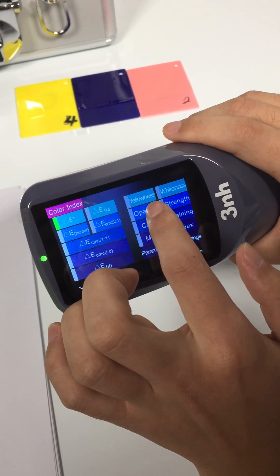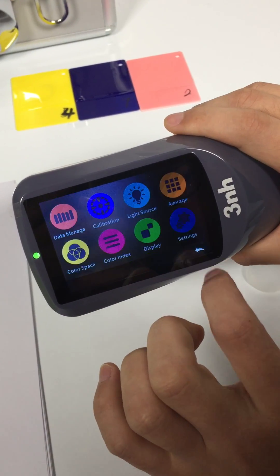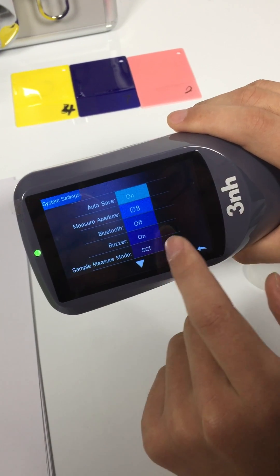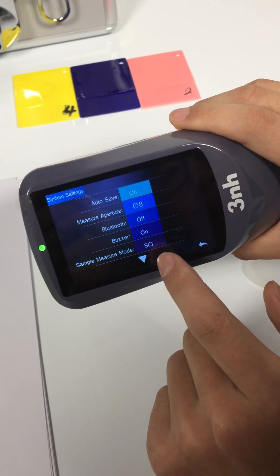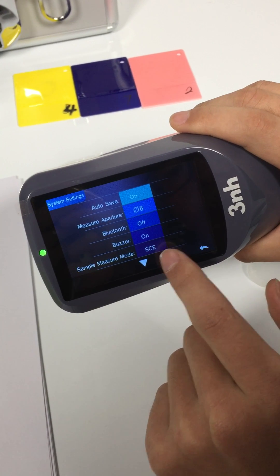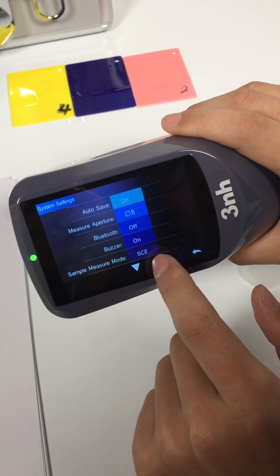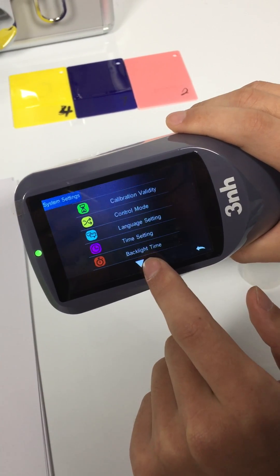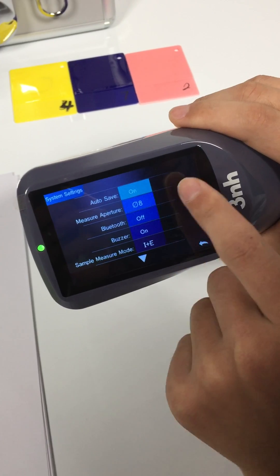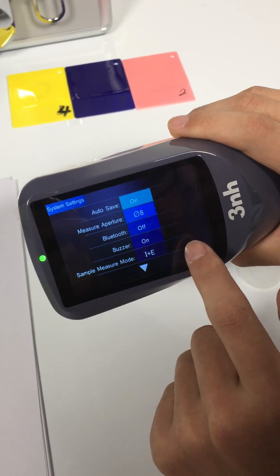Such as yellow index, white index, opacity. Settings — you can change the sample measurement mode, SCI and SCE here.